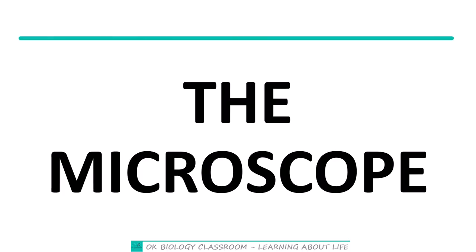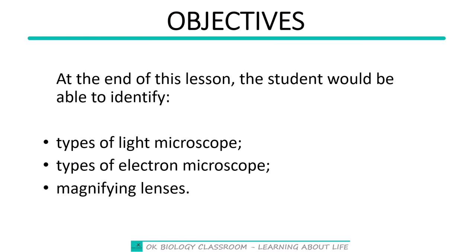Microscope. For objectives, at the end of this lesson, the student would be able to identify the types of light microscope, the types of electron microscope, and as well magnifying lenses.